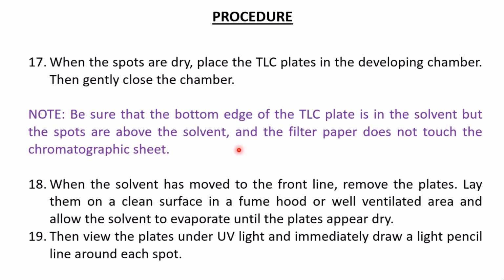Because once your spots are dissolved, then there will be no elution. However, the solvent should come from below the spots and then pick the spots and travel along the plate. So always make sure that your solvent is below your spots, right?